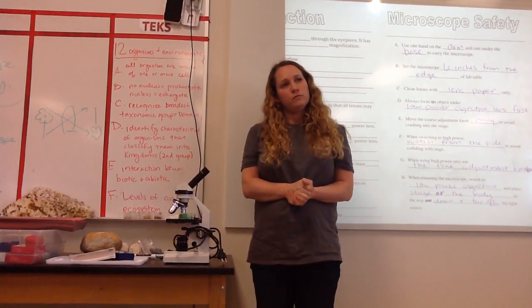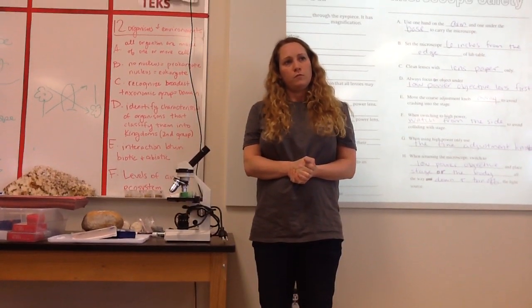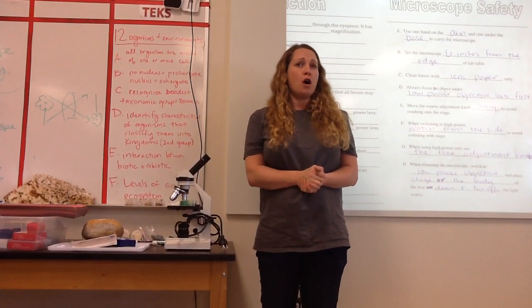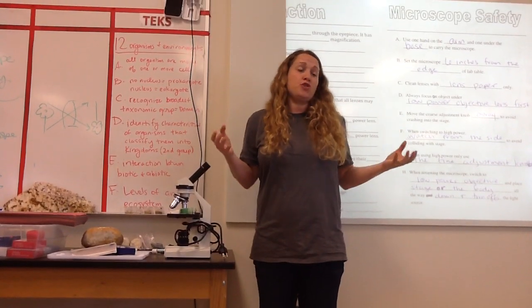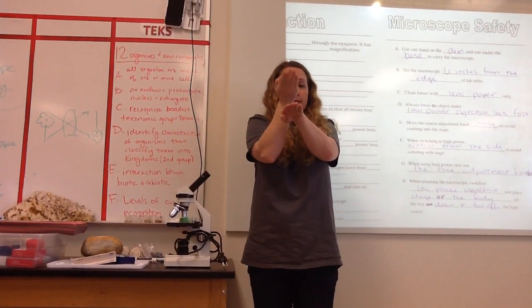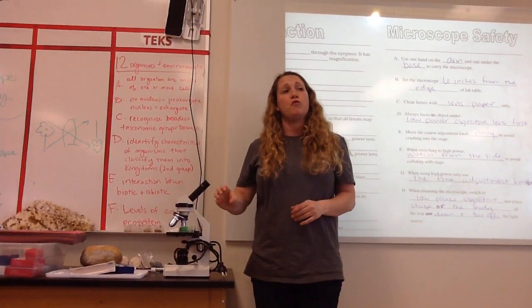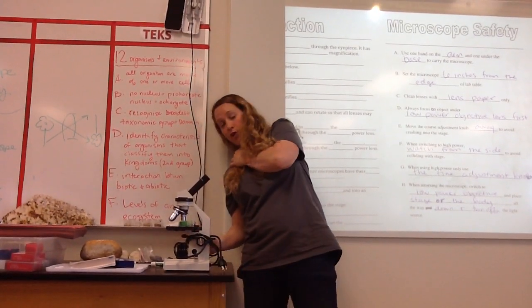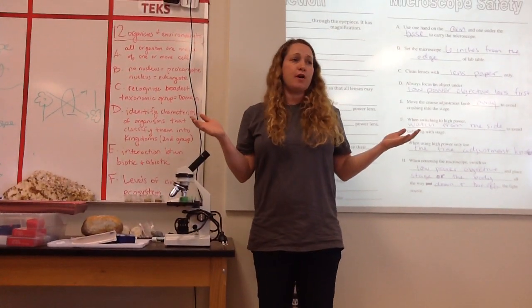So for the big lens, if you push it just a tiny bit where it's just nearly touching, will it break? If they touch too hard, Courtney, they will break. Just like if you clink two pieces of glass together too hard, they'll shatter. It's glass on the upper lens, then glass on the lower lens, and a glass slide in between. There's a lot of stuff that's delicate right there, so you just want to be as slow-moving and gentle as you can, and you never want to move the objects toward each other unless your eye is looking from the side. Okay? Anybody else?